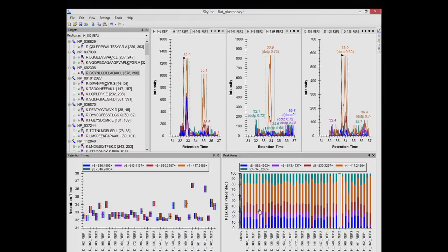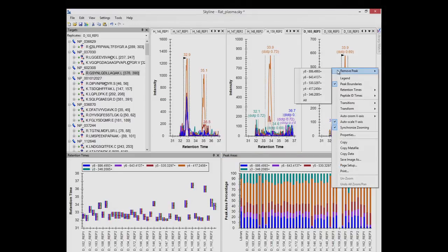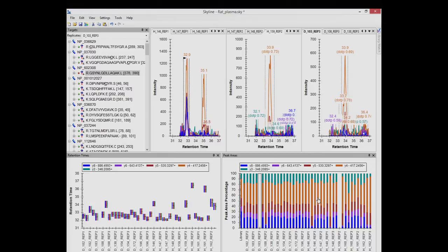And you can go through most of these ones where we have this. You can see the relative ion abundance. Now with that knowledge, if you look at this relative ion abundance, you can basically see which replicates chose to integrate this thing, and which replicates actually have something like this. There are two very distinct patterns going on here, right? And so we can now pretty quickly click through the ones with the wrong pattern.